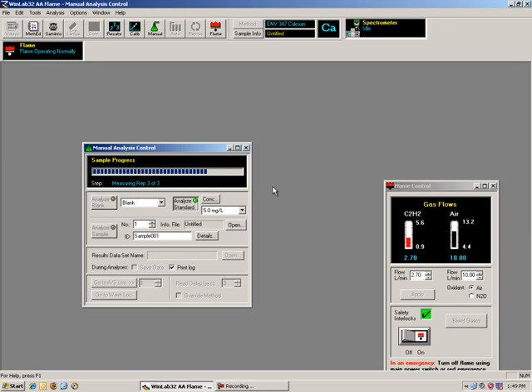I actually have a feeling the recording software might be interfering with this. It just printed out an analysis of the 3 standards. Everything looks fine. I'm going to bring up our standard curve here in a second. Okay, we're in the idle and ready to go for our next standard. I'm going to bring up our calibration curve.